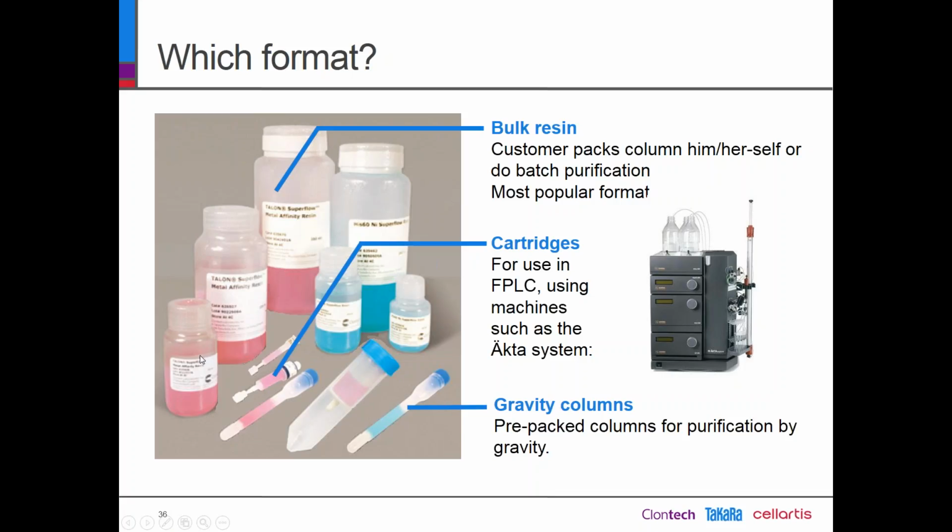You also see here the nice color. So Talon is always pink colored and His60 is always blue colored. This is the natural color which comes from the metal ion inside.